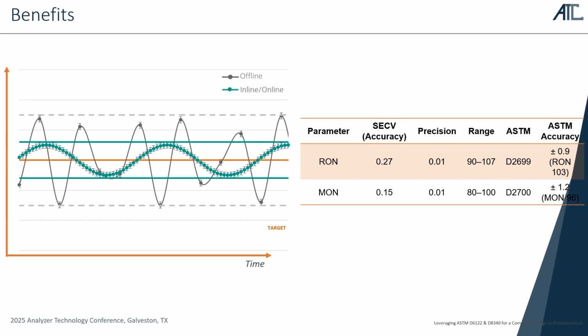I have a question. What do you do about outliers? What I do about outliers? Yes. I saw your graphs, and you had a lot there. But were the red dots outliers of the spectrum? Yeah, if there are outliers detected, and that's why I mentioned ASTM methods, there are Hotelling's T-square, Q residuals, nearest neighbor, so the statistics in the software indicates the sample to be an outlier not fitting to the data set. And then it's the question either to retest them on a different technology to ensure it fits to the data set, or it's probably incorrectly measured, or it's a true outlier. So then they would be excluded.